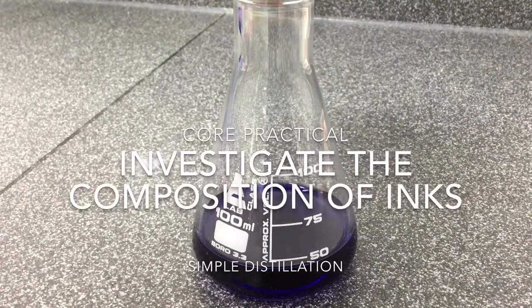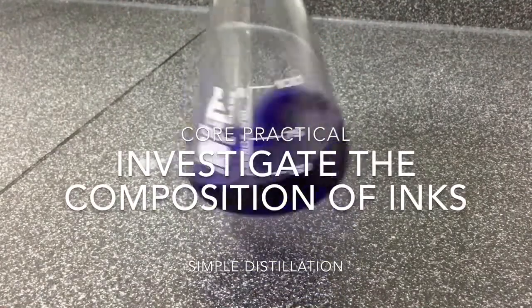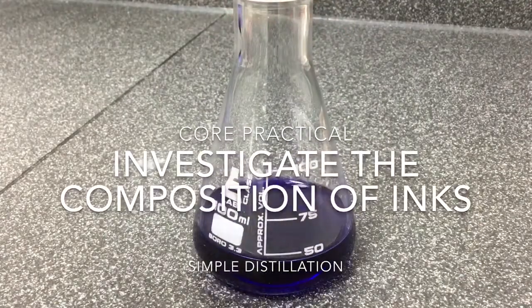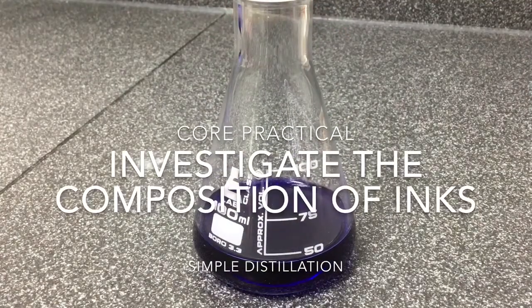In this experiment we will carry out a simple distillation to separate a mixture of ink and water. Given that ink and water have different boiling points, we can exploit this property.